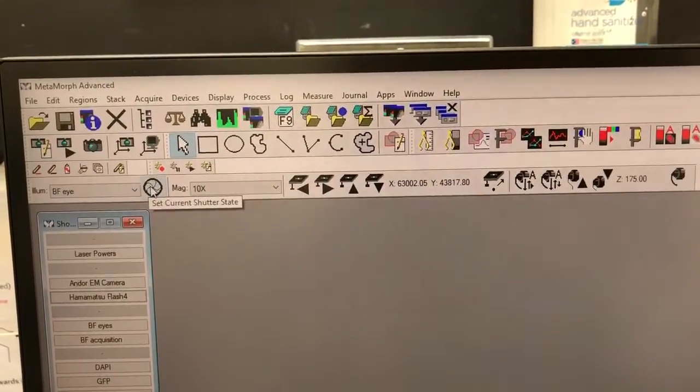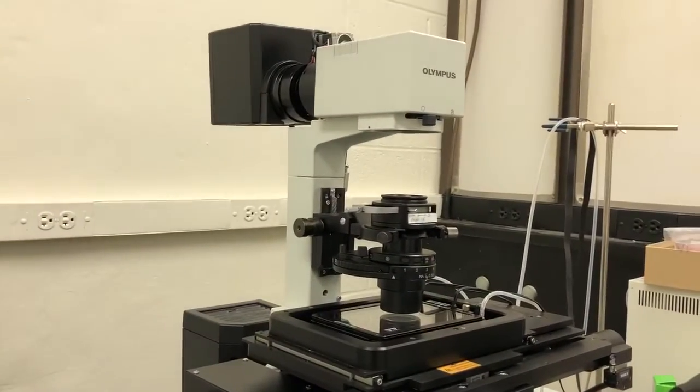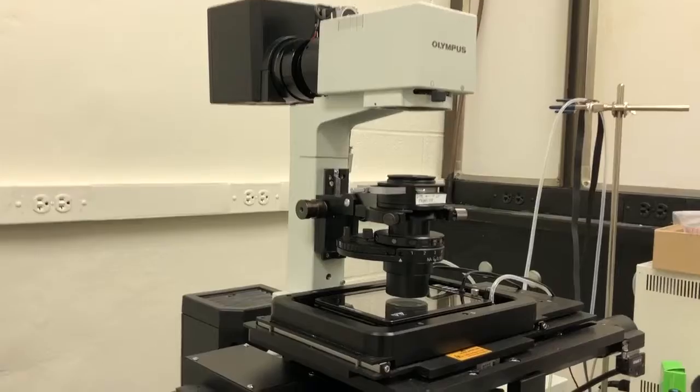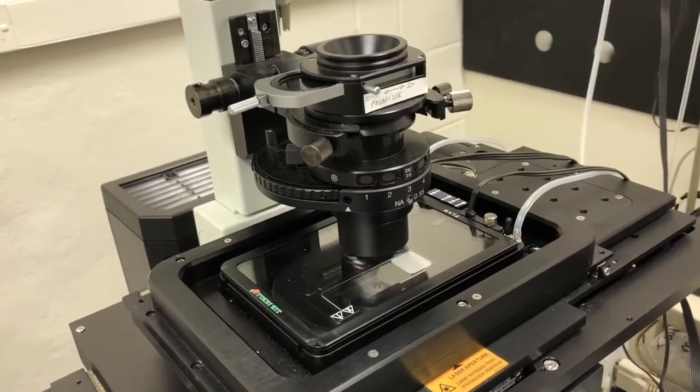And then to illuminate the sample, we're going to click on this button here. That turns on the light and opens a shutter that can illuminate the sample. So now we know that we have light going through the condenser into the sample.